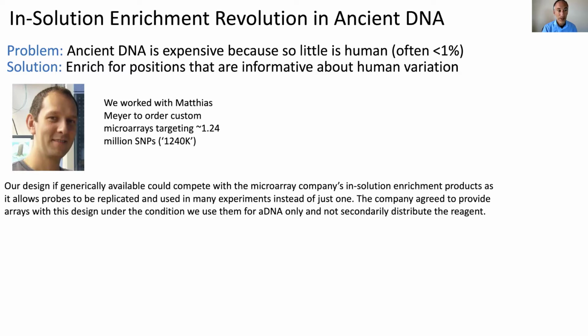So a complication was that our design, if generically available, could compete with the microarray companies we ordered it from in solution enrichment products, as it allows probes to be replicated and used in many experiments instead of just one. The company agreed to provide arrays with this design under the condition that we use them for ancient DNA analysis only, and not secondarily distribute the reagent beyond the groups that collaborated to produce it.